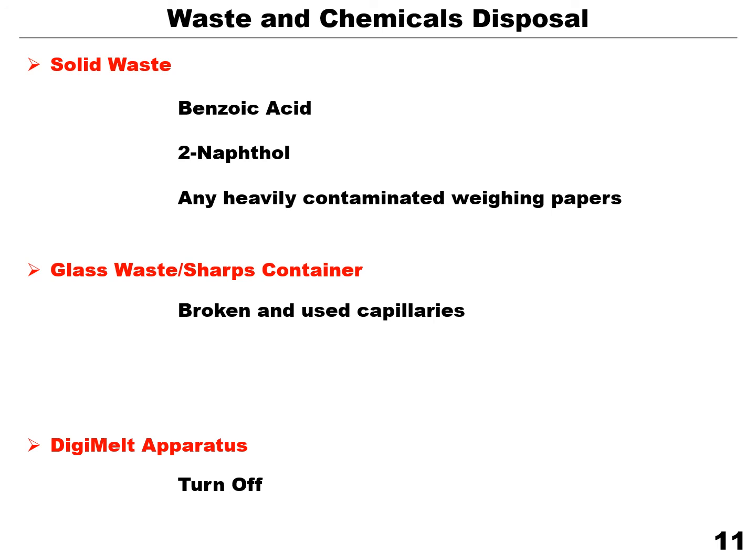Again, the capillary tubes are not going to be used again, they are disposable, and they should be kept in a container labeled broken glass waste. And also a critical task to remember is to turn off and return the apparatus back to its respective shelves.